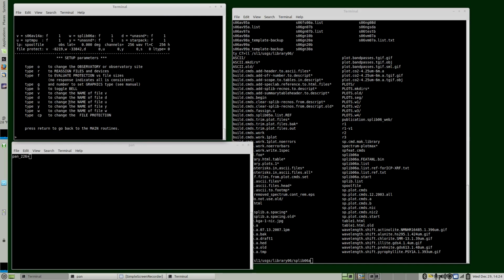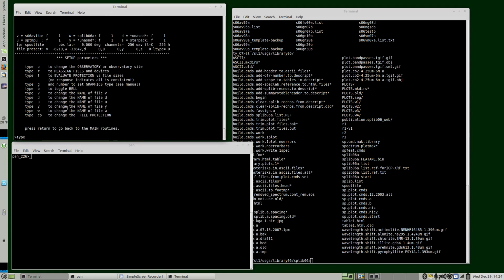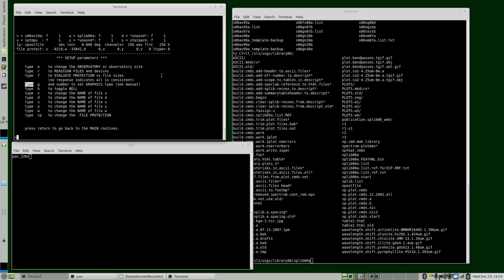So with Linux, again, if you double click on a word, it highlights it, and then you can go and paste it with the middle mouse button. Very quick. You don't have to do Control C or Control V, or if you type, you can do copy and paste. Those are actually different buffers. So you have two different buffers in Linux. You have the quick buffer and then the Control C buffer.